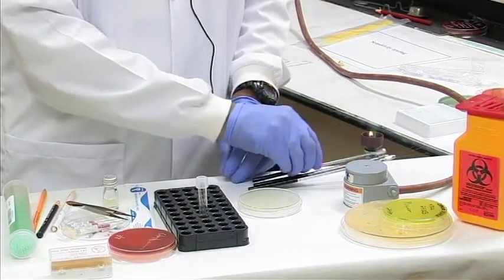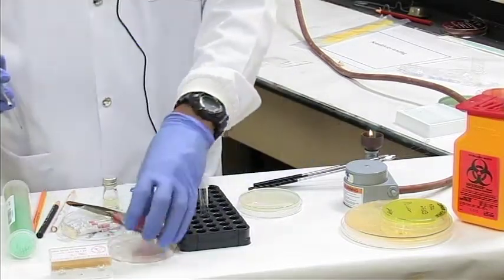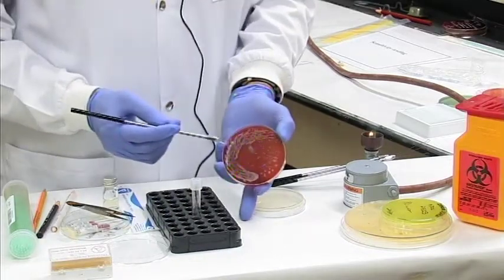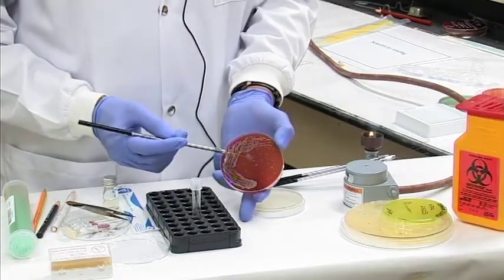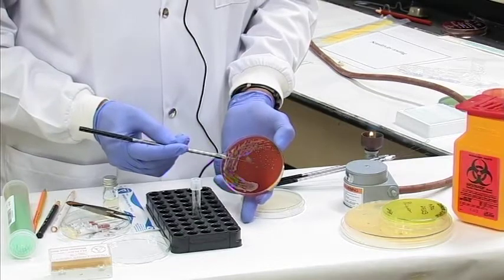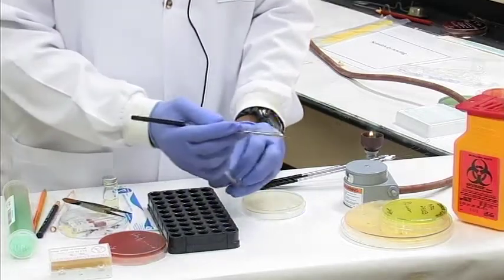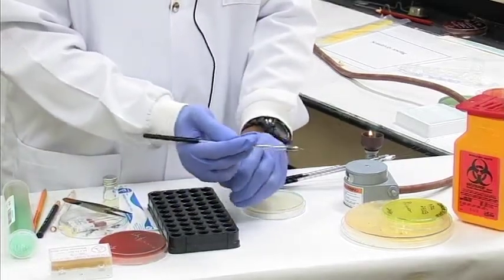We're going to use a flame-cooled loop, and we're going to pick up colonies. So remember, I explained before what a colony is. A colony is one of these dots, and we're going to pick up just about 2 colonies and inoculate it into some saline.